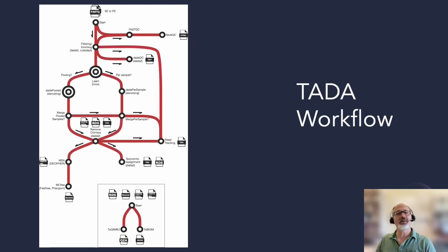So we developed this workflow. I'll have this in more detail at the poster. So if you want to stop by, I can actually go over the steps. But to give you an idea, we start with FASTQ, single and paired end reads. We end up, after removing chimeras and using DADA2, generating ASVs in FASTA format. We do an alignment if an alignment is needed. That's optional. And then a maximum likelihood analysis using either FastTree or the R package phangorn. Taxonomic assignment is currently performed using DADA2's assignment steps, though we have talked about adding in additional support using QIIME 2.